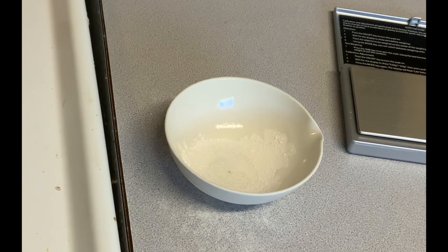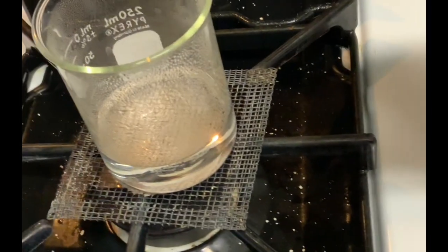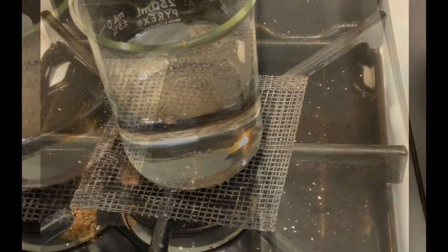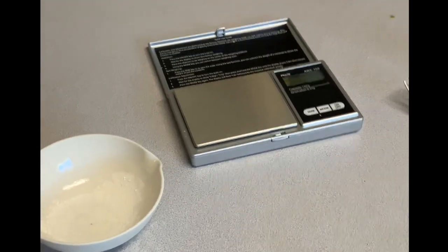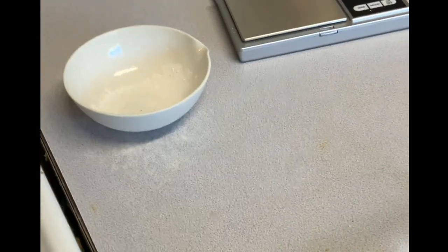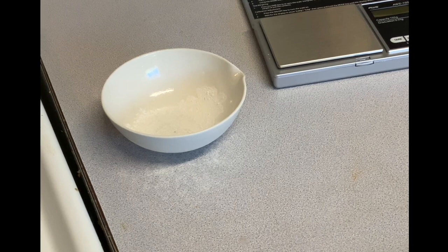In the meantime, to prepare for the second trial, what you can do is add more water to the beaker. While that is just sitting on your stovetop, go ahead and allow the evaporating dish to cool. The next procedure is to weigh the evaporating dish with the residue.